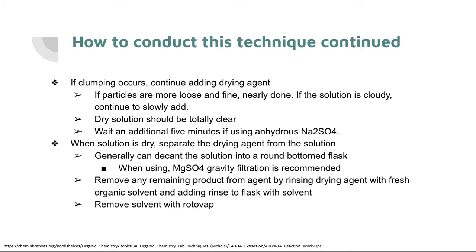If it's cloudy, that means there are still more particles floating around, so continue to slowly add, but maybe in smaller increments. The dry solution should be totally clear. But in instances where you're using Na2SO4, it can take a bit of time, so maybe wait an additional 5 minutes. When the solution is dry, go ahead and separate the drying agent from the solution, generally by just decanting.